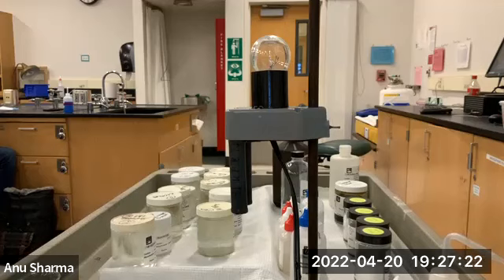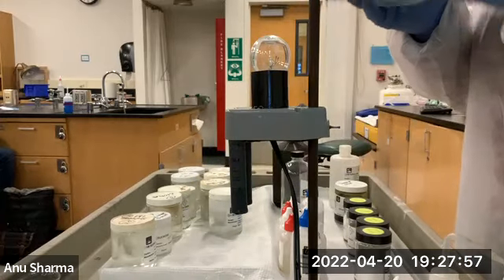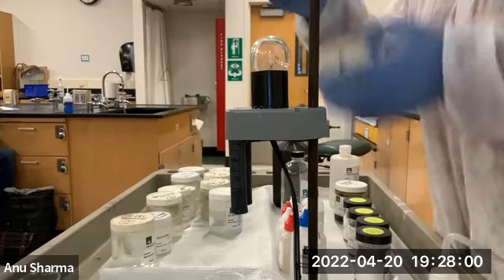Got it? Okay. Now the next is these reactions, conductivity before mixing, conductivity after mixing, and explanation. Here in the questions, we already covered these reactions, the molecular, ionic, and the net ionic equation. We've already covered that in the lecture. But let's look at now when ammonia and acetic acid mix. Okay, what happens? So ammonia is actually ammonium hydroxide. It's ammonium ion plus OH ion because ammonia reacts with water.